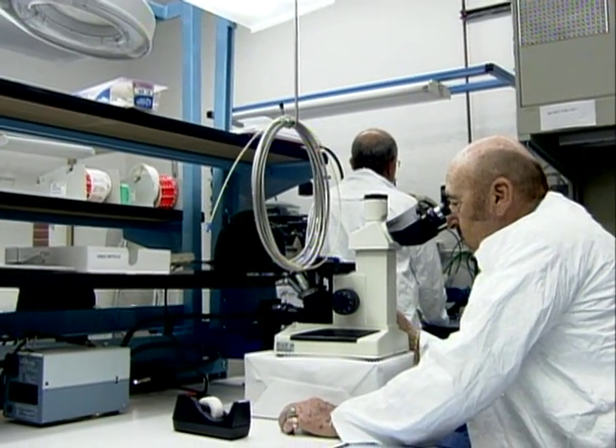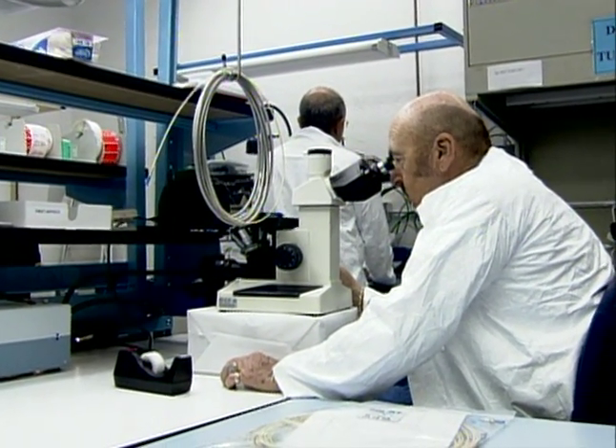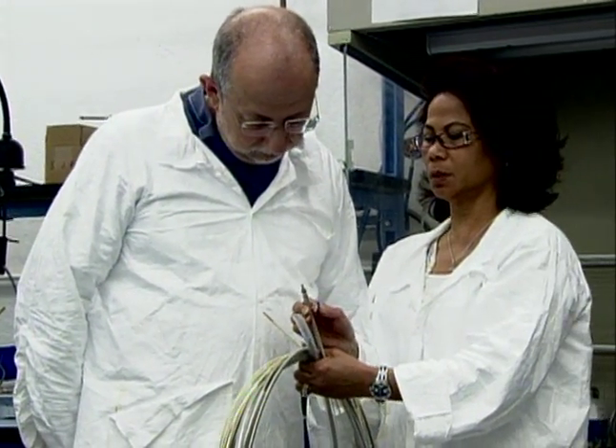From prototype through volume production, all assemblies and micro-components are inspected in an assembly QC lab to ensure customer requirements are fully met or exceeded.